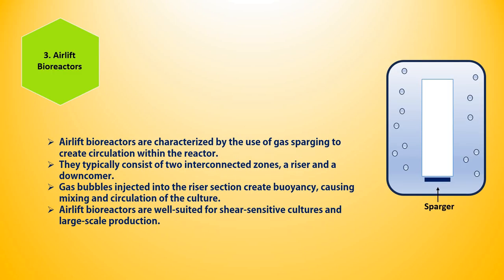Number 3 is the airlift bioreactor. As I already told, airlift bioreactors and bubble column bioreactors utilize spargers or air bubbles for the stirring of the media within the bioreactors.